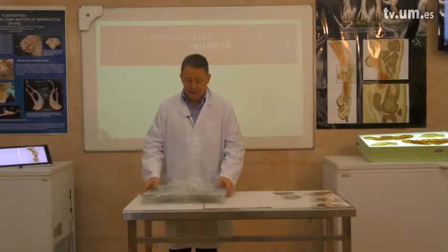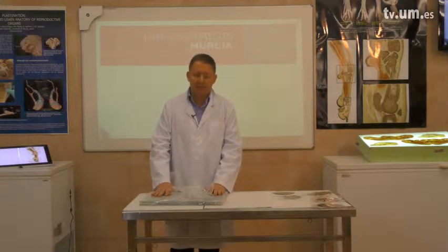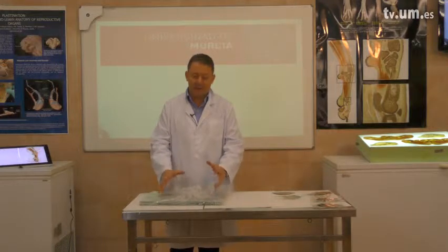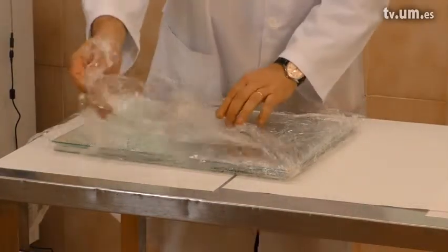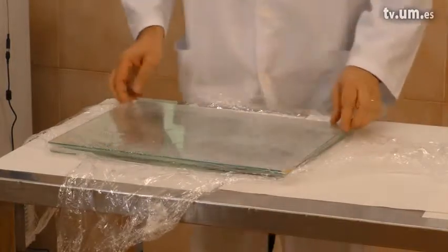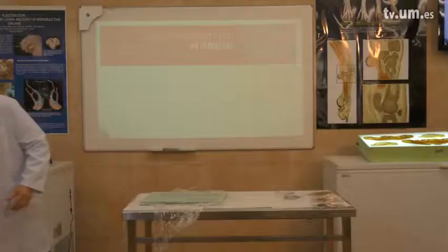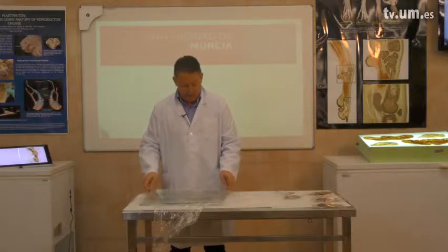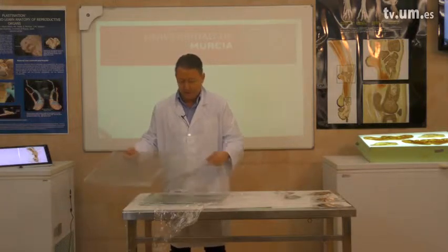The sandwich stack was in the oven for four days at 45 degrees. Now the resin is hardened and we have to open the stack. We have to dismantle our slices, so we open the covering foil, take out the glass plates first. After each glass plate is removed, we have our slices.